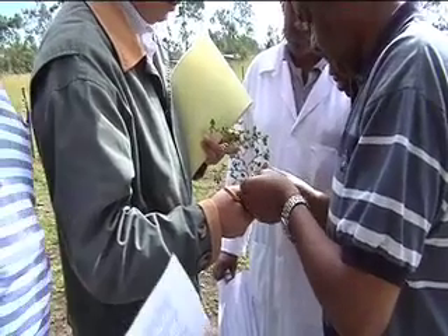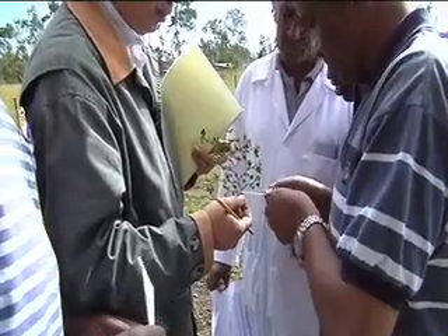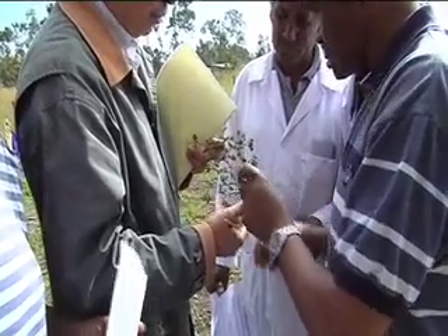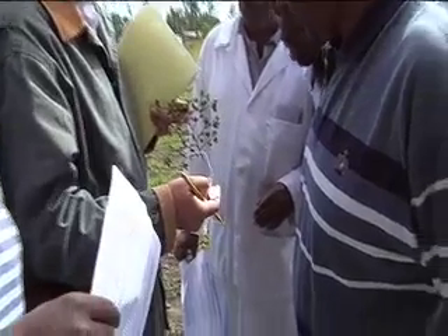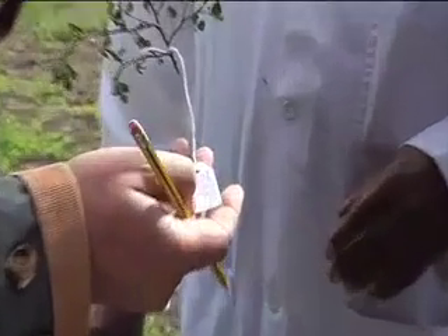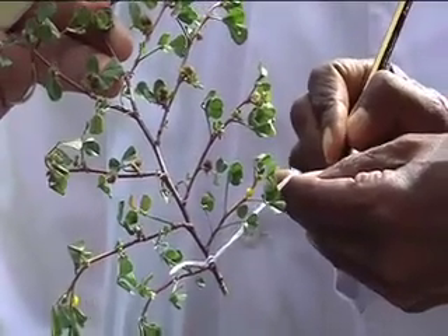The first thing is to label the tags: label the species, the genus and species, the accession number, the plot number, and on the back the site. The site is Shola, and the date. Correct labeling is very important.